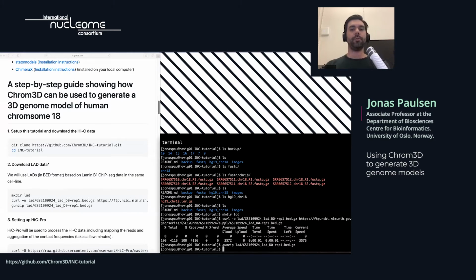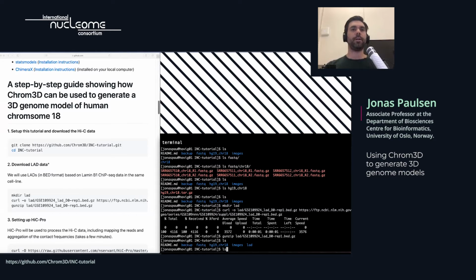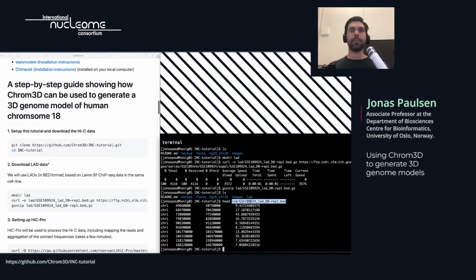I'll just show you. You don't have to do the same as me now, where I will just show you what these LADs look like. It's a BED file, so giving the chromosome start and end positions of the LADs, and also a score that gives an indication of the quality of the calling algorithm on the LADs, basically.